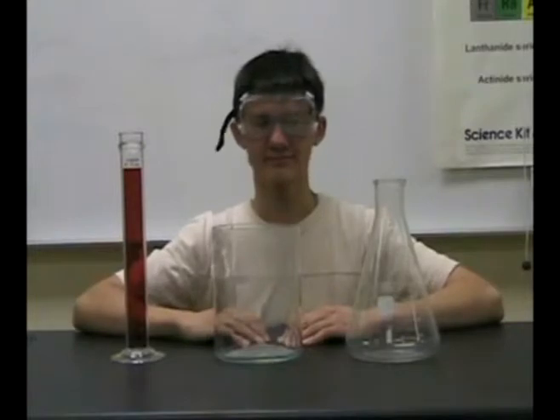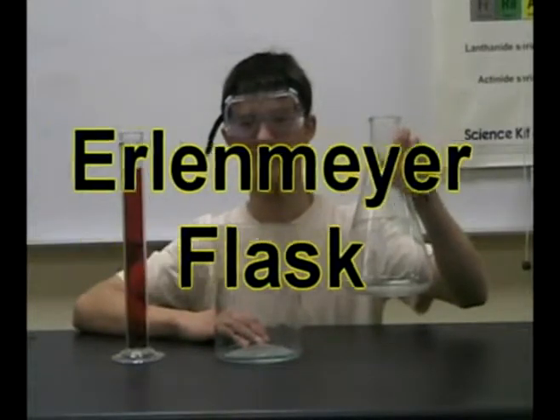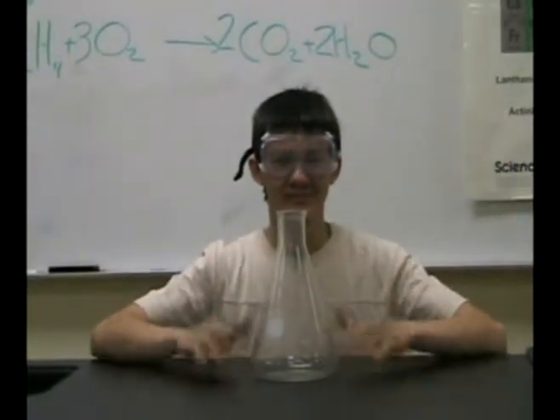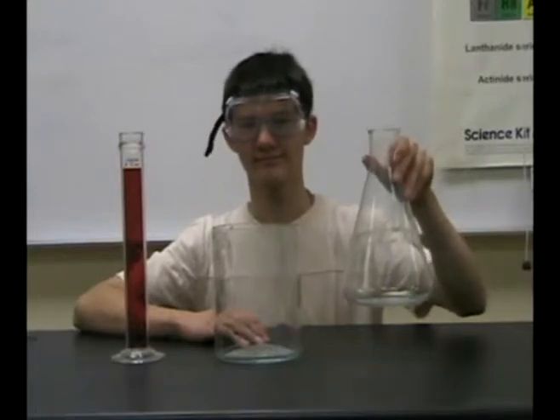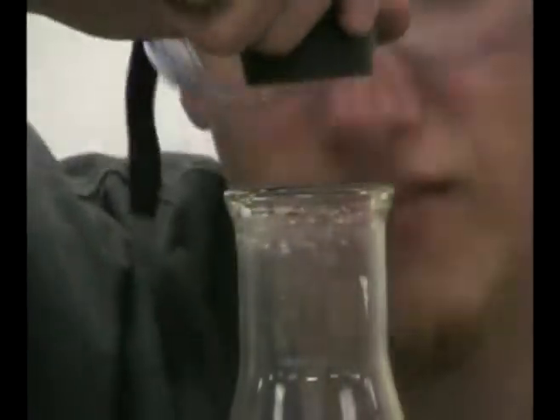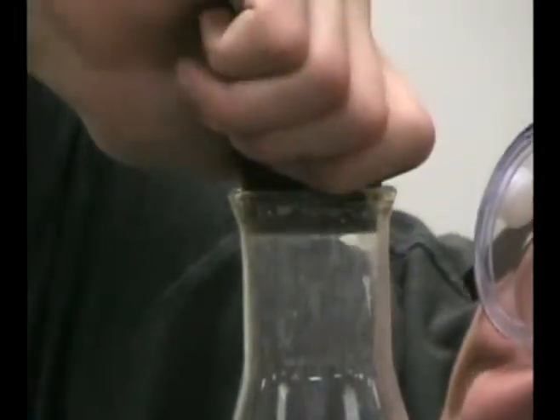The next instrument we will look at is the Erlenmeyer flask. Erlenmeyer flasks have weird shapes. As you can see, a stopper fits easily on top. These are all the most important chemical holders in a chemist's lab.